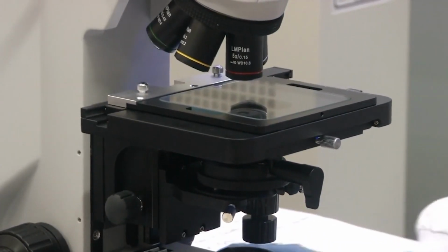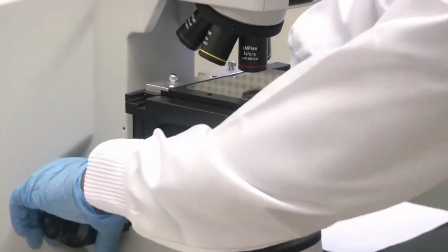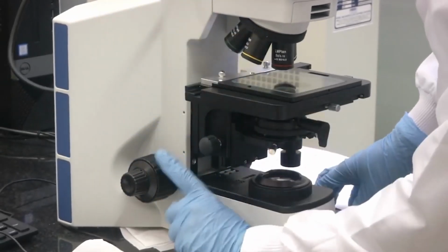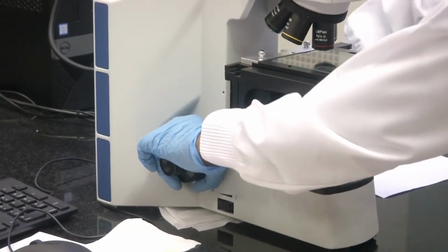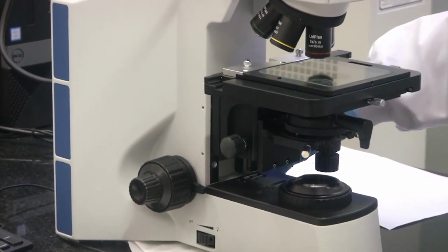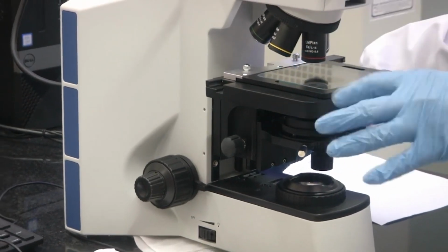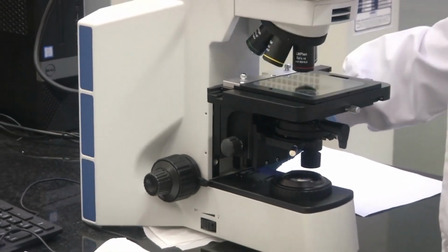Now just like in the stereo microscope, we have two knobs here. These two knobs, you can see, just follow my gloves. This knob is used for coarse adjustment of your focusing. As we had seen before, the stage we can move in x and y direction, but to focus you need to move your stage in the z direction, so that your sample comes into focus with respect to the respective objective that you have used in the turret.